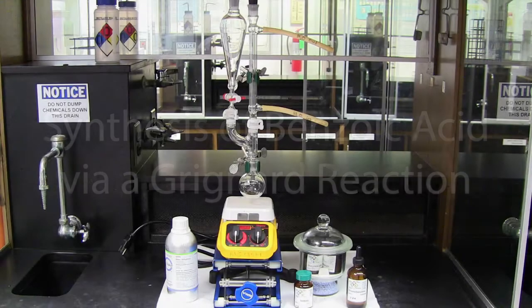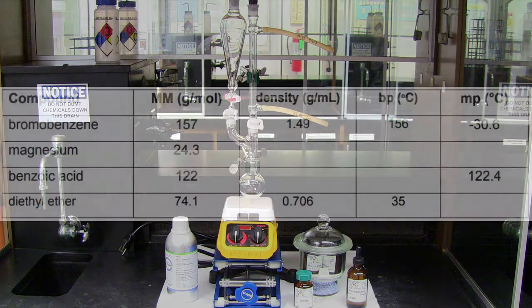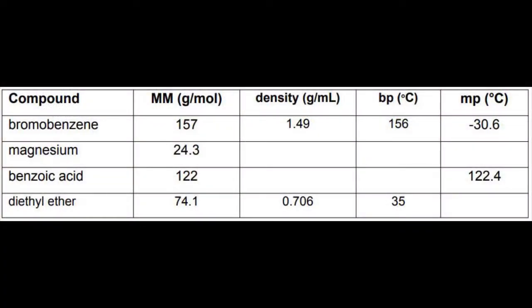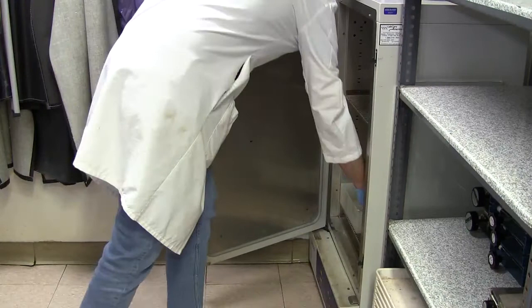In this experiment, we'll react magnesium with bromobenzene to form phenylmagnesium bromide, the Grignard reagent. We will then react the Grignard reagent with dry ice, solid CO2. After acidification and workup, benzoic acid will be isolated. This reaction is extremely sensitive to moisture, so the apparatus needs to be set up as quickly as possible.